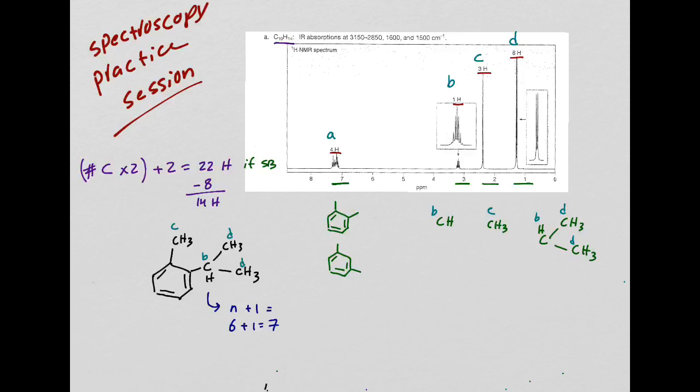Now, what are going to be my aromatic hydrogens? There's a hydrogen here, hydrogen here, hydrogen here, and hydrogen here, and all those are overlapping. That's where I get a big mess over here. These are all overlapping, and that's why I get a big mess in this region. Yeah, this is pretty reasonable. I'm pretty happy with this.